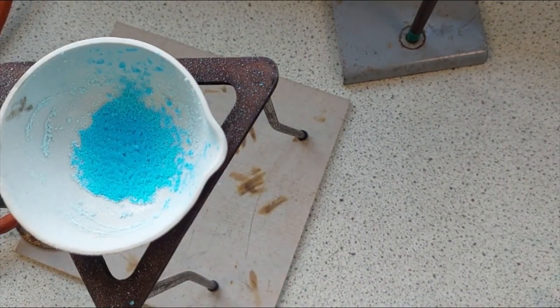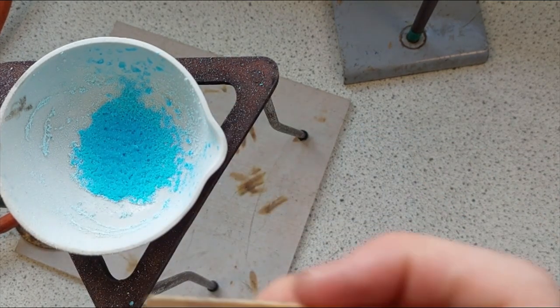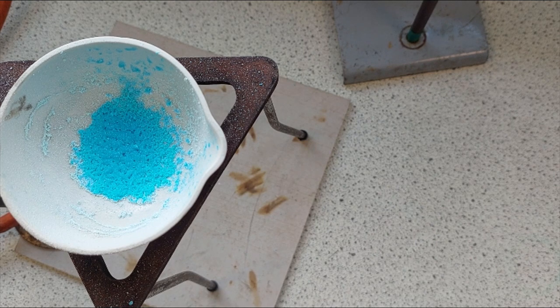And here we have the final product. You can see this blue powder at the bottom. That is the copper sulfate. Because I've heated it up until it fully evaporated, sadly we can't see the actual crystalline structure, but if it had been left on a windowsill, we would actually see small little diamond shapes, clear, looking like glass, but beautiful blue coloured little diamonds. And if we leave it to evaporate over a longer period, they become larger and larger. So there you have it, crystallization following filtration.